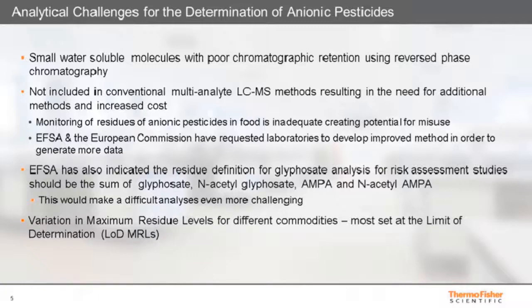Among all challenges, the European Food Safety Authority has also indicated that the residue definition of glyphosate for risk assessment studies should be the sum of glyphosate and its relevant metabolites, N-acetyl glyphosate, AMPA, and N-acetyl AMPA, which would make the analysis even more challenging.